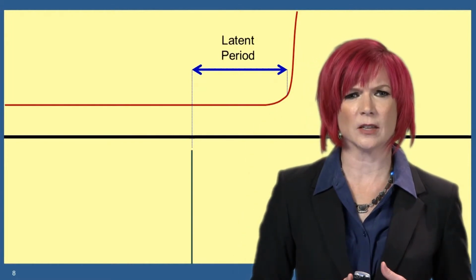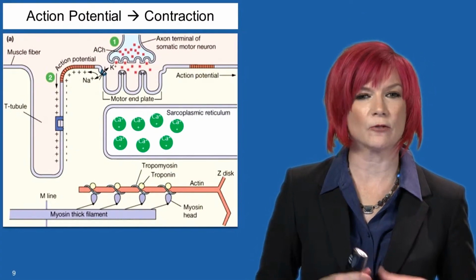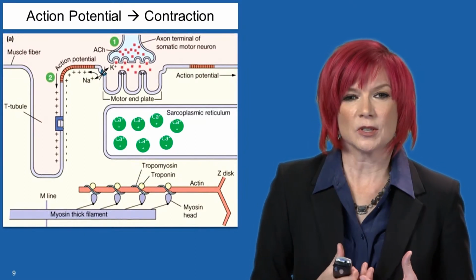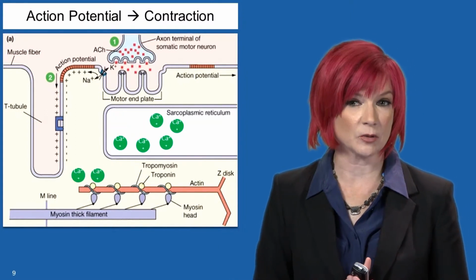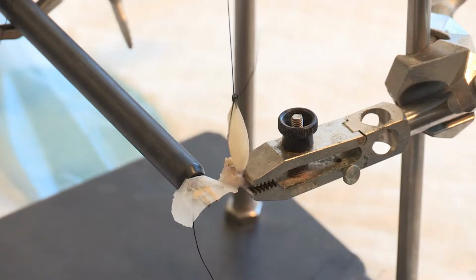So what causes the latent period? The latent period is the time required for all of the molecular machinery that we've discussed in our course to begin working. There is time needed for the propagation of the action potential, release of calcium stores from the sarcoplasmic reticulum, and cross-bridge cycling. Here we can observe tetanic contraction.